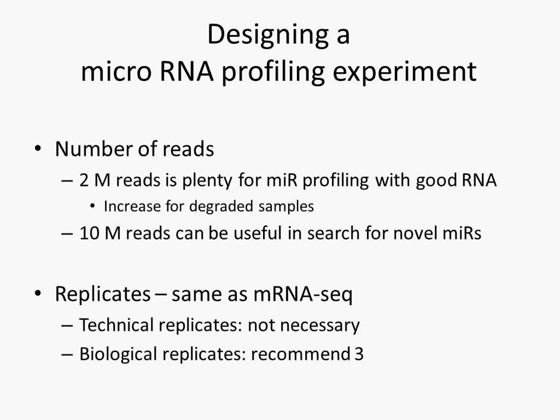So how do you design a microRNA profiling experiment? In terms of number of reads, 2 million reads is usually plenty for microRNA profiling with good RNA.